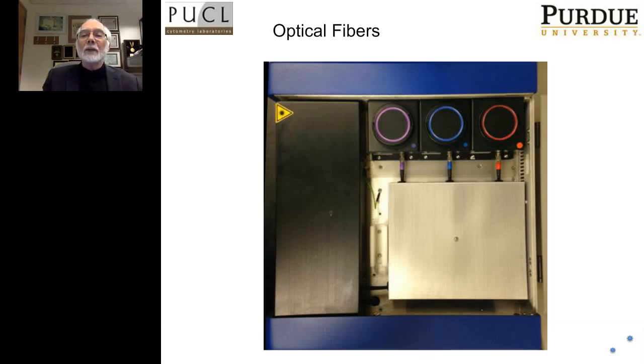What's actually happening underneath there is that there are on some instruments a trifurcated fiber, or one with 4 fibers coming out, and that cover is really there just to protect those fibers.